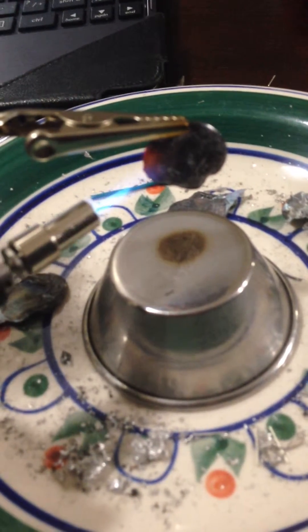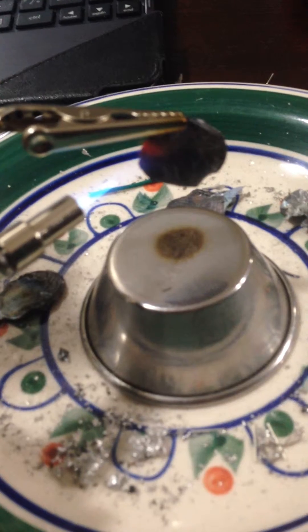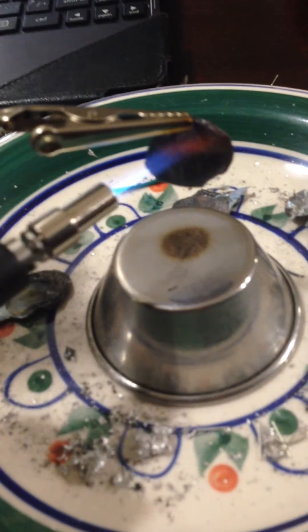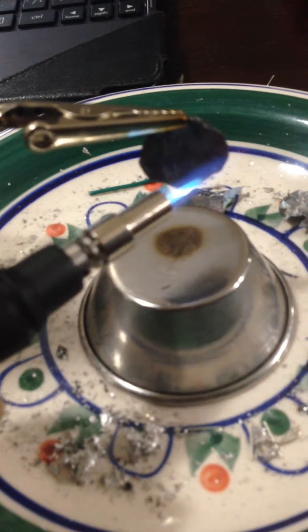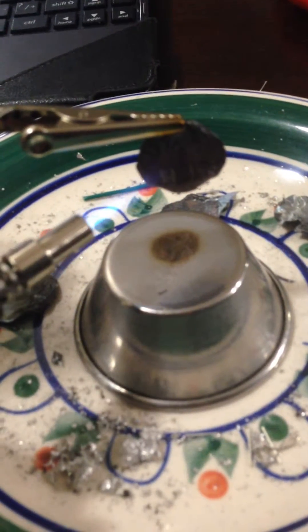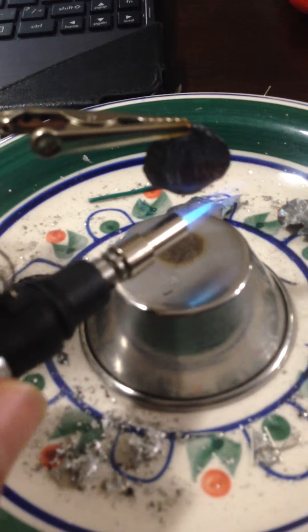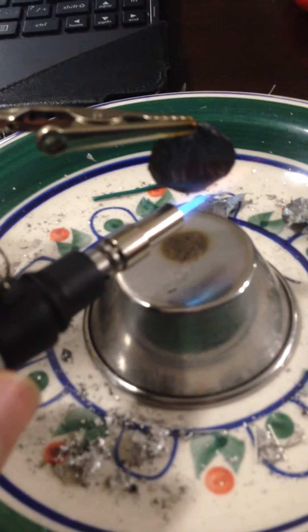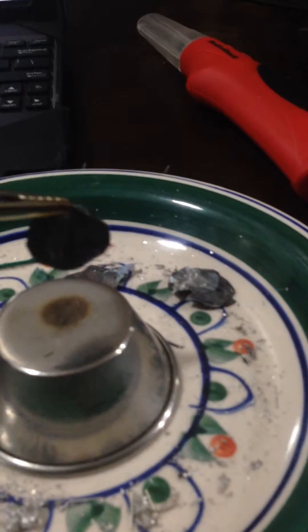So here it is. Now it's pooling, slowly pooling underneath. And once you have that, braze the underside. And then give this a little jiggle.